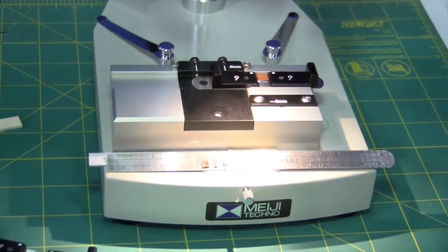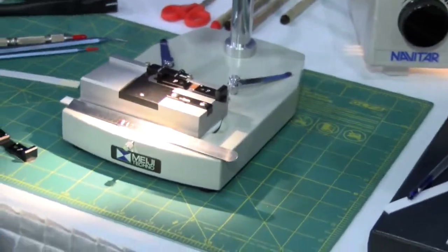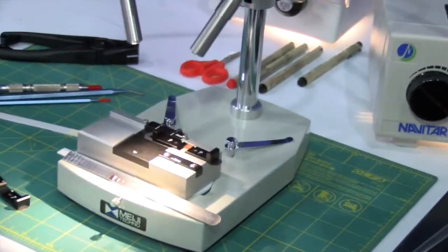We will now look at a full sample process from beginning till end.